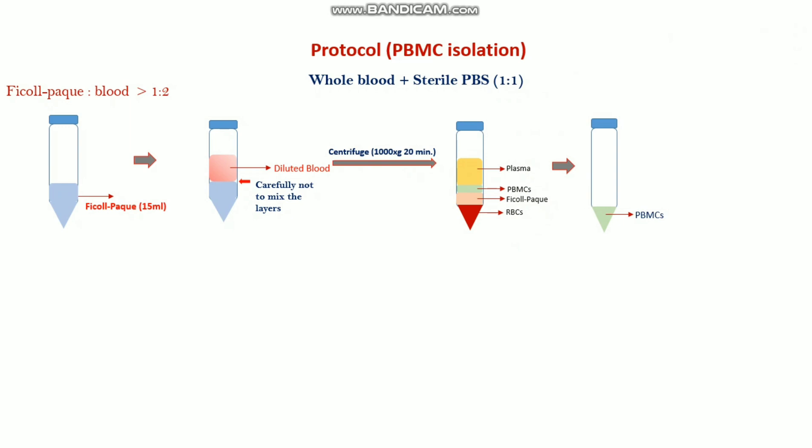Very gently discard the plasma layer, then collect the PBMC into another sterile tube. Wash it twice with sterile PBS and collect the PBMC. This is a simple process but you need to be very careful at each and every step.